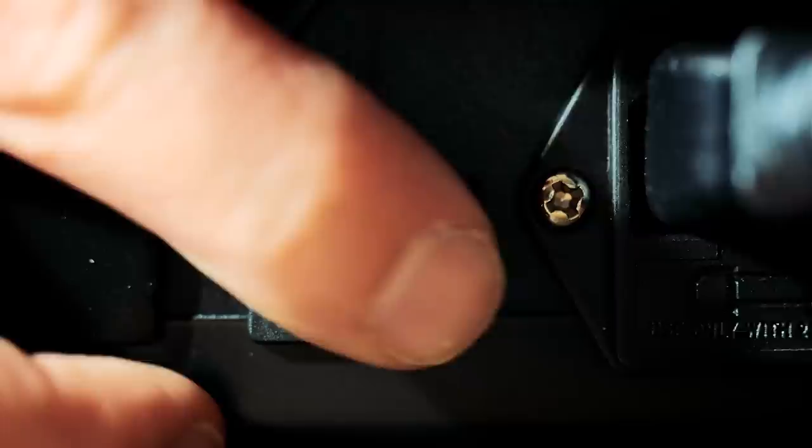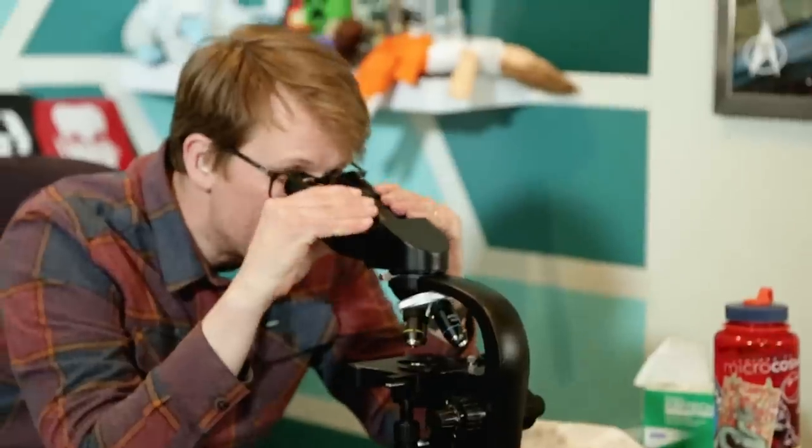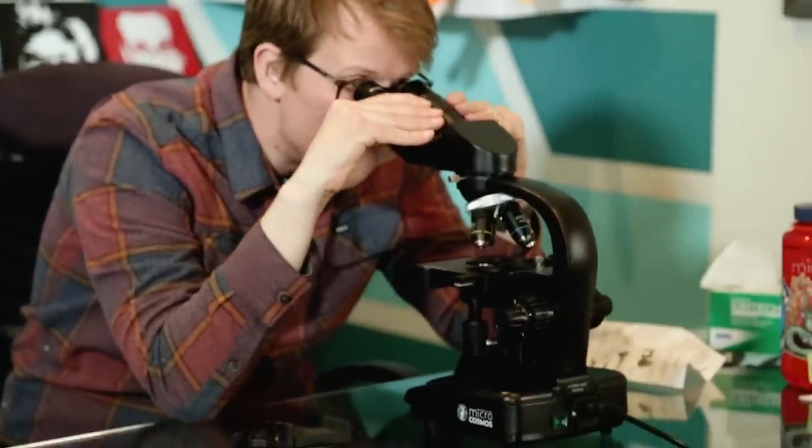Now remember, eyepieces are always loose, so do not turn your microscope upside down — the eyepiece will come out and fall onto the ground. A little switch, and the light is on. I'm seeing a bunch of magnified nothing now — this is just magnified light.